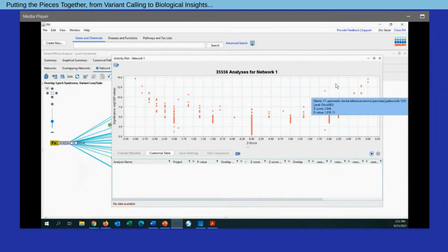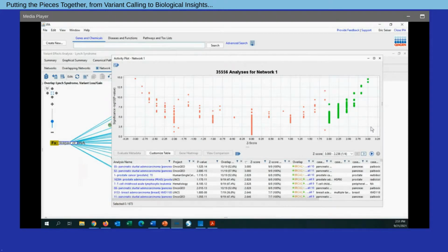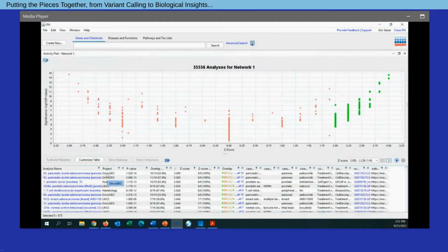Very simply here, I can grab, let's say, all the studies that show a value above 2, again, a confident prediction in a match. And as I select these points, what I will generate at the bottom here is a table of all the studies, again, that show conservation of the signature and decreased expression of these loss of function variant containing genes. So within this table, lots of different characteristics that capture, essentially to the right here, the case and control criteria that are used in the comparison, as well as details about the overall comparison.